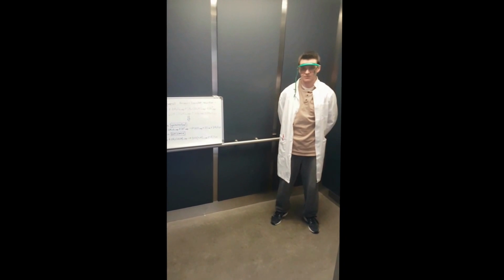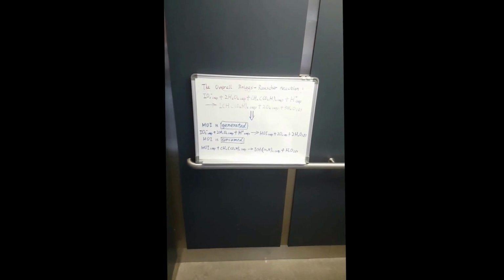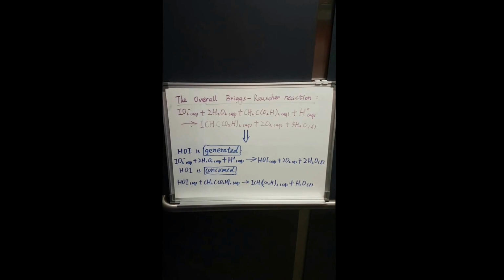Yo, what's this? This is the chemistry elevator. Okay, explain to me, what's this? This is an example of the yellow-blue switcheroo, which is an oscillation reaction.